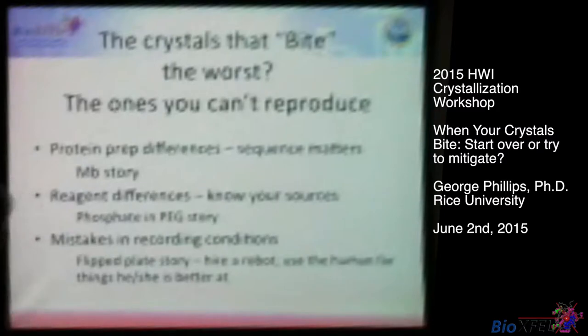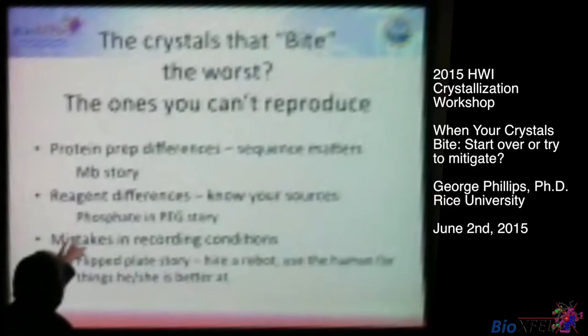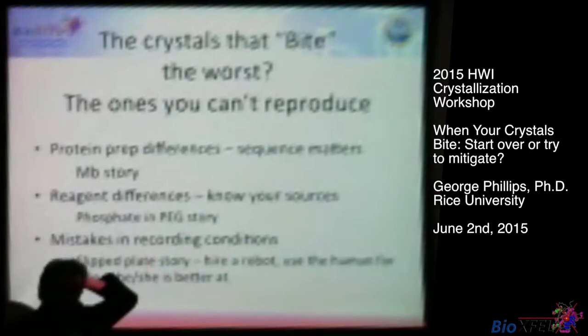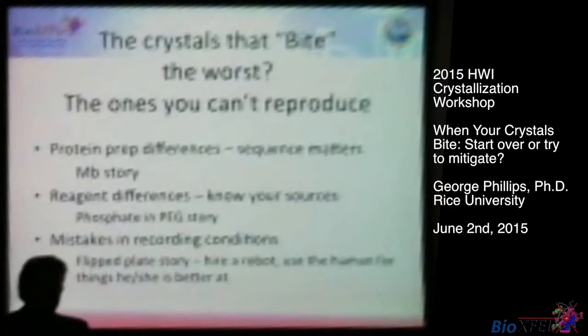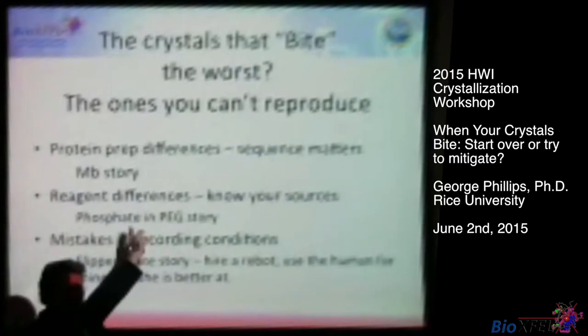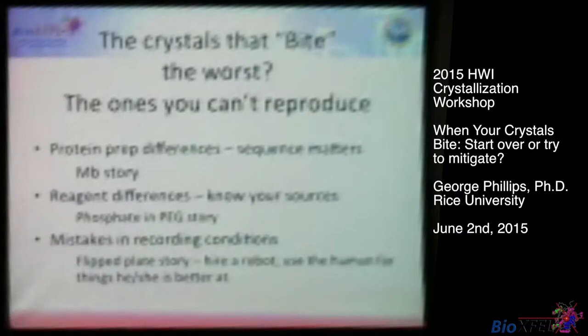You keep trying. In the second case, they had switched bottles of polyethylene glycol, and eventually, after 6 months of trying, they were doing analytical chemistry on each of their reagents, and they learned that polyethylene glycol, when it synthesizes, is sometimes quenched with phosphoric acid and sometimes with hydrochloric acid, and that this is not on the label. As soon as they started adding back phosphate, they immediately got their crystal form back, right? So that's a story I tell people to impress upon them to understand their reagents in order to not wind up, in this case, with the non-crystals.